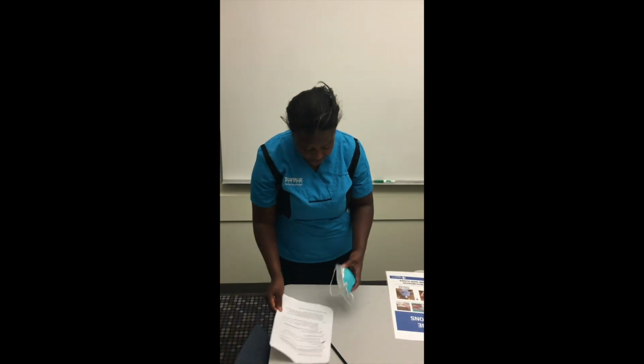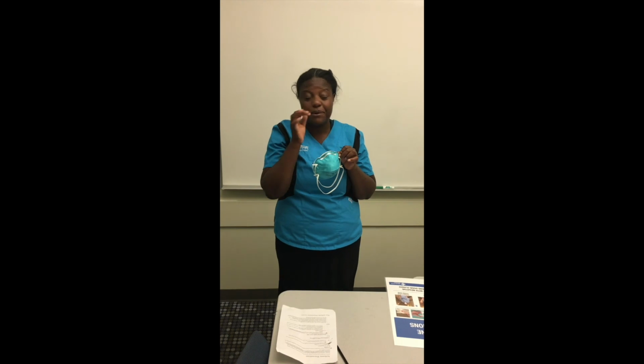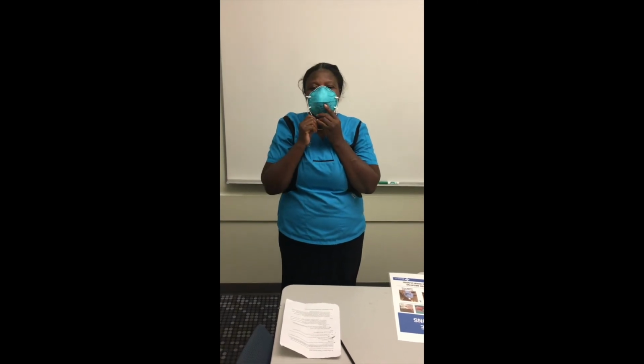So I will just show how to wear the N95 mask. You fix it on your nose and make sure it fits properly so that the air does not escape from your nose. So you put it on and make sure it fits properly on your nose. And that is how we do it.